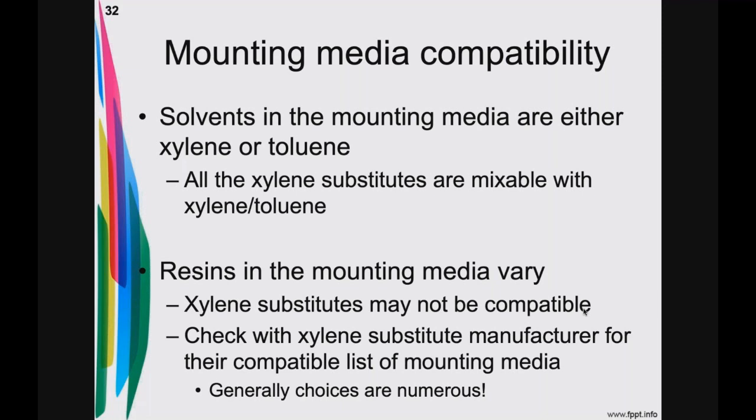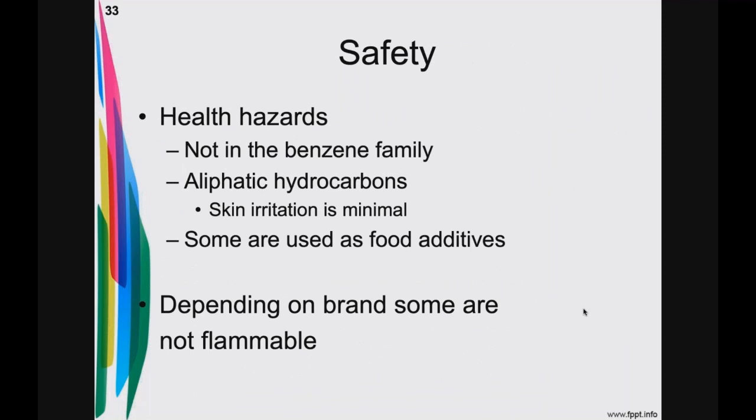Every manufacturer has a list. If they're selling a xylene substitute, they have a list. Their tech support has a list telling you these are the mounting medias that are totally compatible. And like I said, the list is huge. So generally, people are not having to switch their mounting media at all.